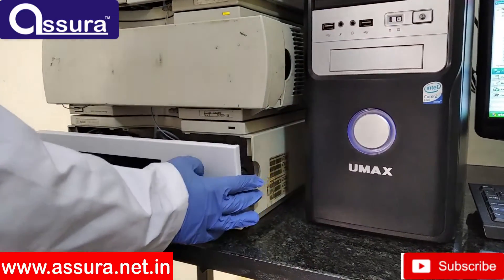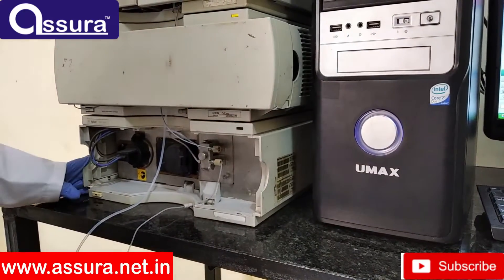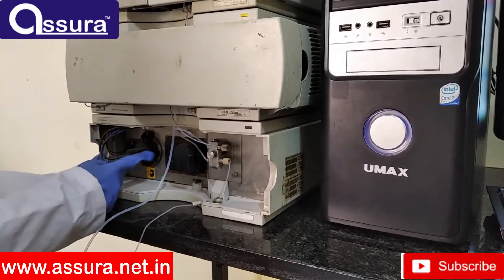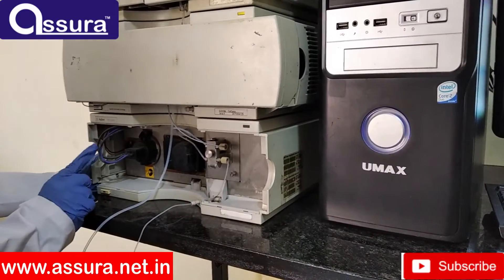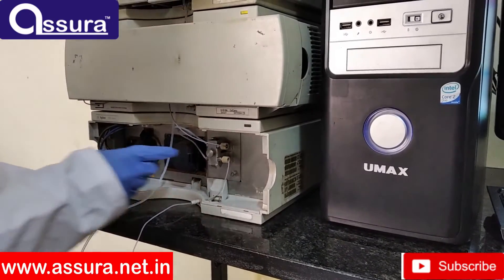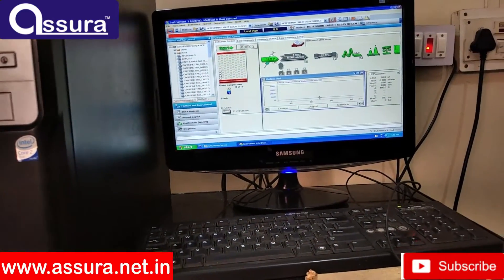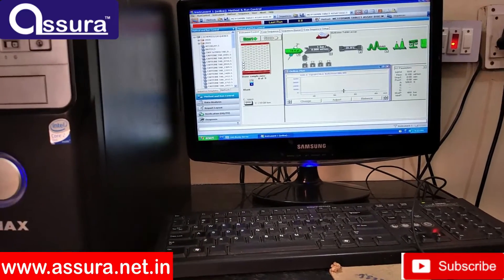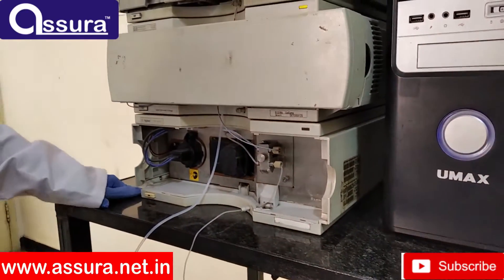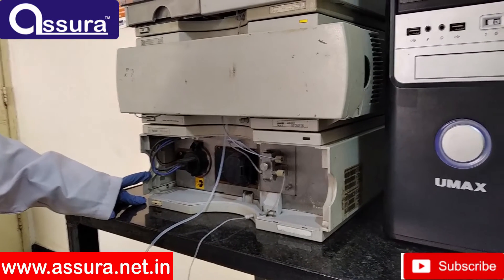Next is the detector. A UV-visible detector is used to detect the separation and concentration of components in a sample. This detector contains a UV-visible lamp having a capacity of more than 2000 hours. The detector has the ability to sense the presence of a compound and send its corresponding electrical signal to the computer data station. It indicates the change in composition of the component by measuring physical or chemical properties, and detects absorption of chromophoric analytes based on the molecular structure.